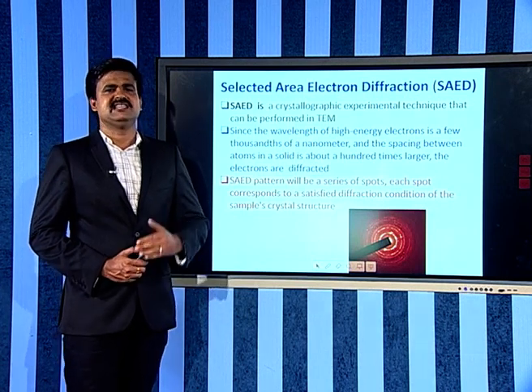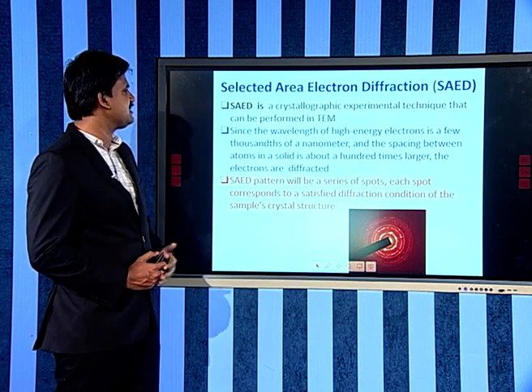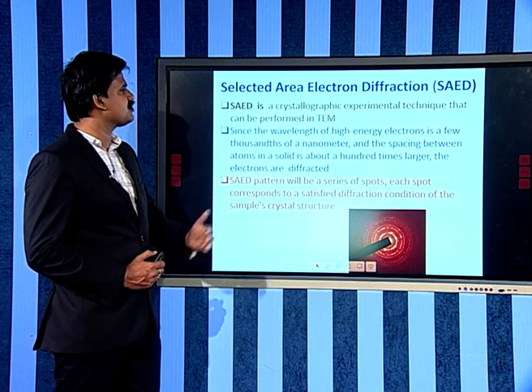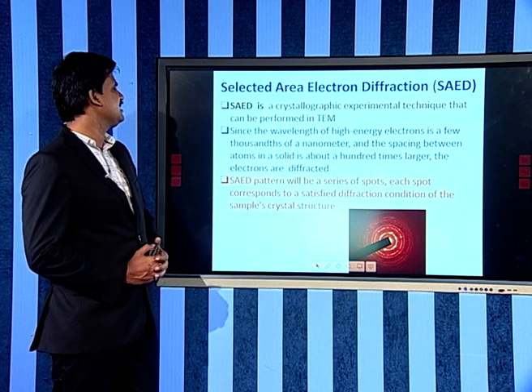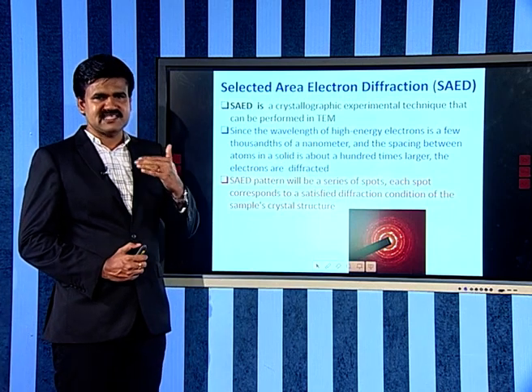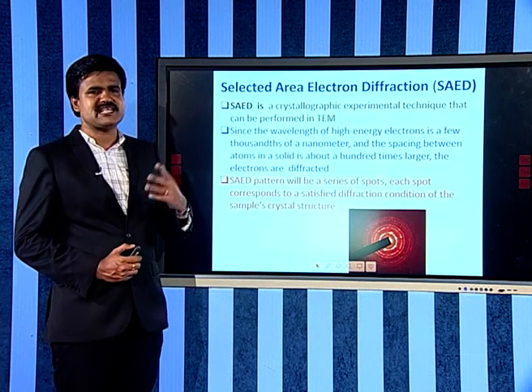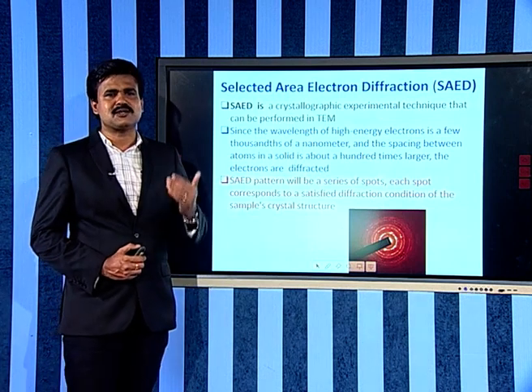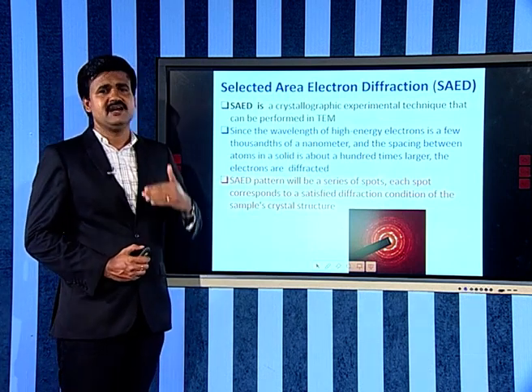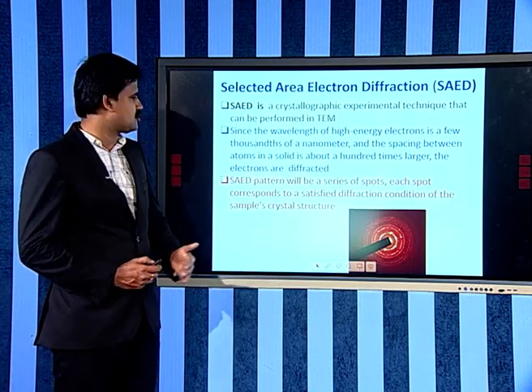Since the wavelength of the high energy electrons transmitted is a few thousandths of a nanometer and the spacing between atoms in a solid is about 100 times larger, the electrons can be diffracted. That is, electrons can undergo diffraction during the experimentation in transmission electron microscopy.